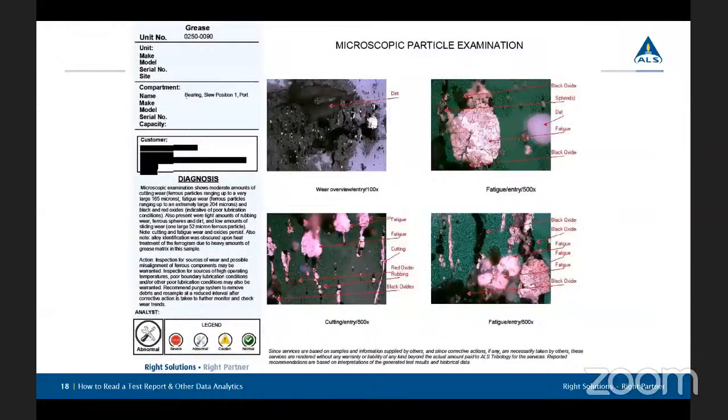And what that magnet does is it aligns ferrous particles, so that way we can get an idea of what's ferrous, what's not ferrous. And then we look at it under a microscope, and we magnify it up to 500 times. What that allows us to do is see the morphology of those particles, so we can get an idea of what the wear mode is that created them.